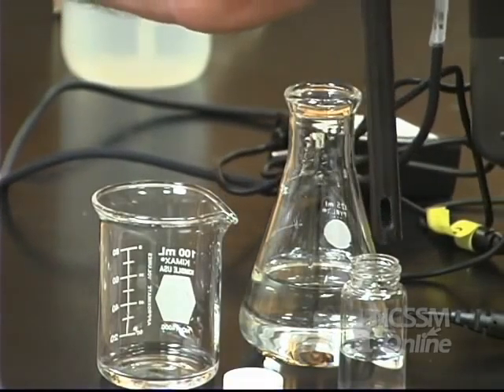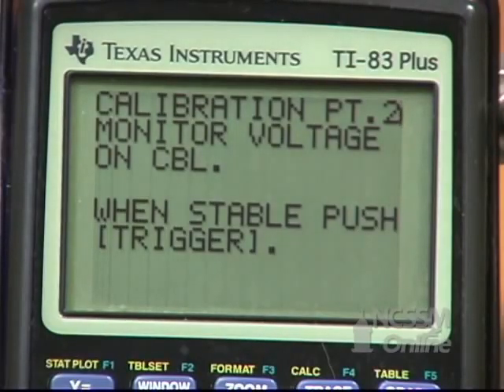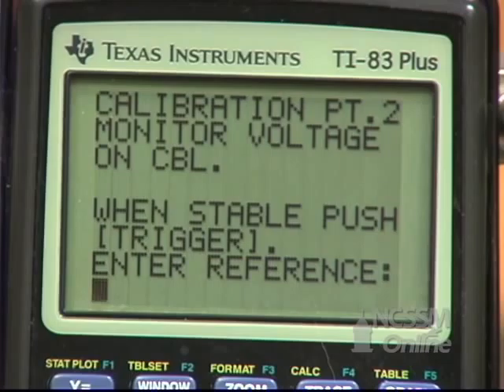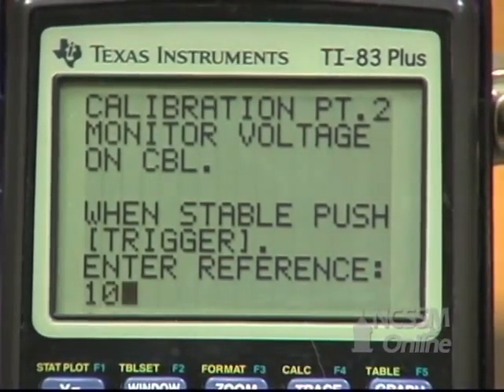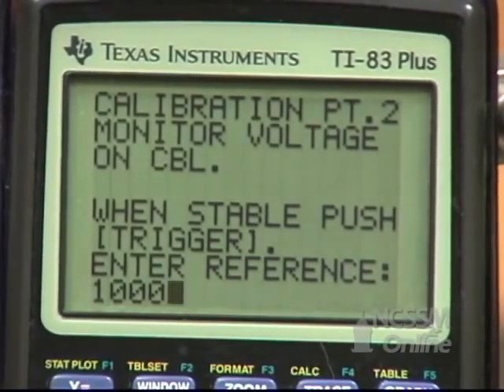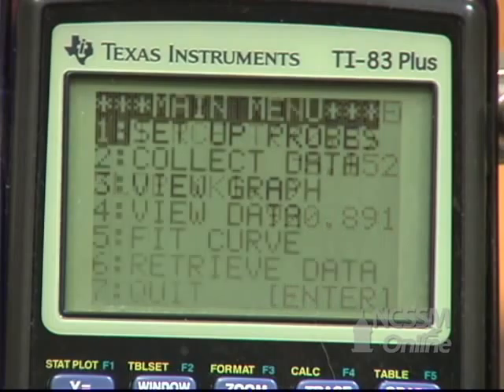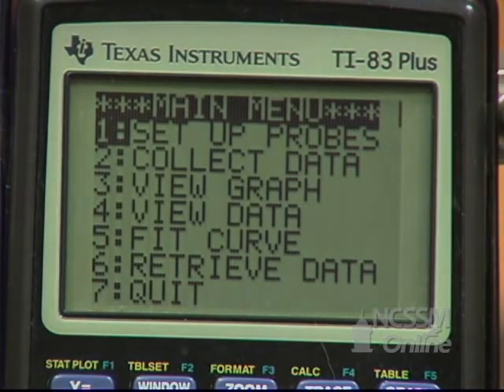Place the conductivity probe in the standard solution and wait until the CBL reading is stable again. Press Trigger on the CBL and enter a reference value of 1000. You'll get a slope and intercept for the calibration line, and this will take you back to the main menu.